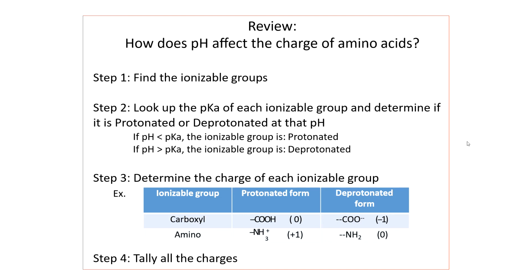Usually you don't have to start out doing this if there's something already known about the protein. This information is available on databases online. So this has already, to some extent, been worked out for you. This is just an example of how you can do this.